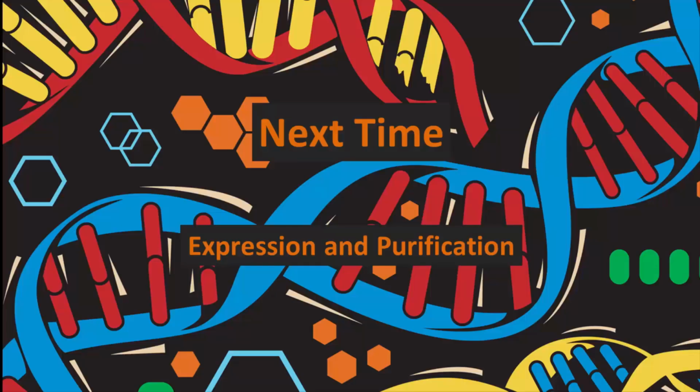Next, we'll put this plasmid in E. coli, express the protein, purify it, and start using it in experiments.